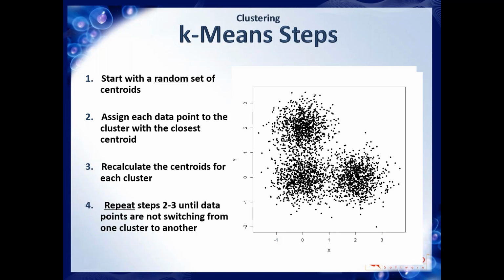Basically, you type the number, like 3 in this case. Let's say that we want to cluster this data set. Again, it's a very basic data set. It's just 2 parameters, 3 very clear and very round shaped populations. So let's say that we define 3.